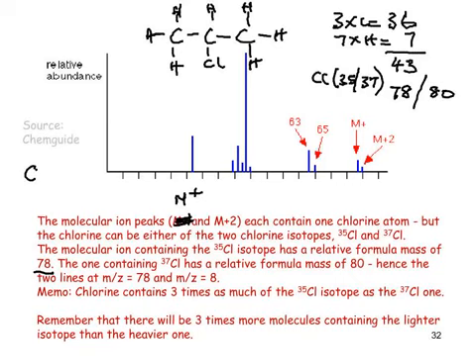43 and 37, 80. Now again, unfortunately the numbers haven't come out on this grid here. This particular line here is 80, 70, and so on. Maybe you can count them back there. Where we've got this very tall line, it's 40 there just to the left of that. That's 50, 60, and so on. This would be 30 and 20.